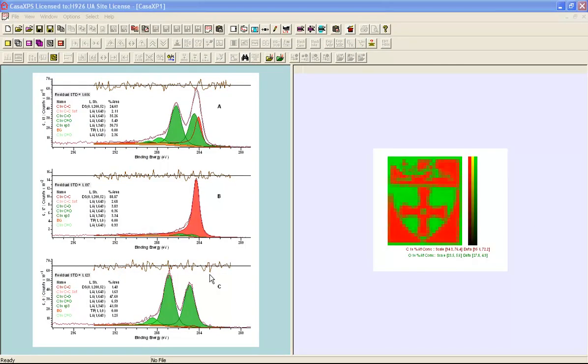When we construct a peak model, the peak model is typically designed using bell-shaped curves. In this example we have a set of bell-shaped curves that fit the data and represent chemistry of carbon within the sample that is characteristic of graphene oxide. Similarly, we have a spectrum here that is mostly reduced graphene oxide, and the shape of these components are characteristic of the reduced graphene oxide.